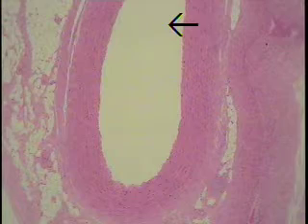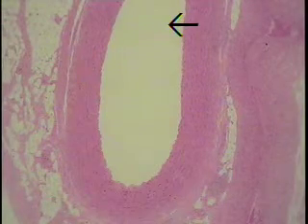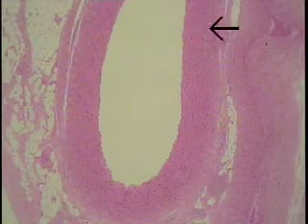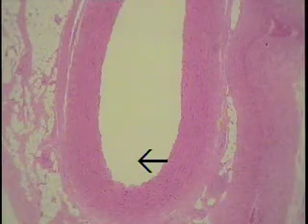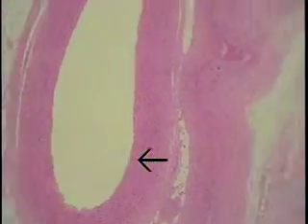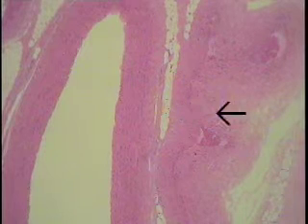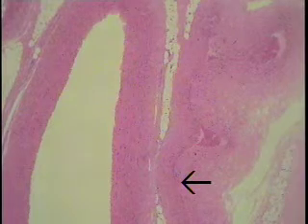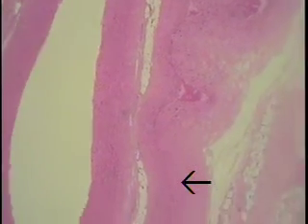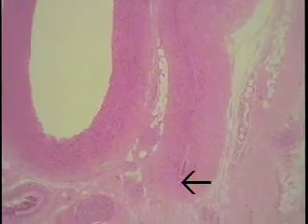Next, examine slide number 40. This is a neurovascular bundle, actually the carotid sheath, and what it contains is the common carotid artery, as shown here at the arrow. If we move the slide over, one can see a collapsed jugular vein. Its external wall extends from here to here. Its lumen is collapsed and shown at the tip of the arrow. Let me trace that for you. So it's a fairly large vessel, and here it opens just slightly.